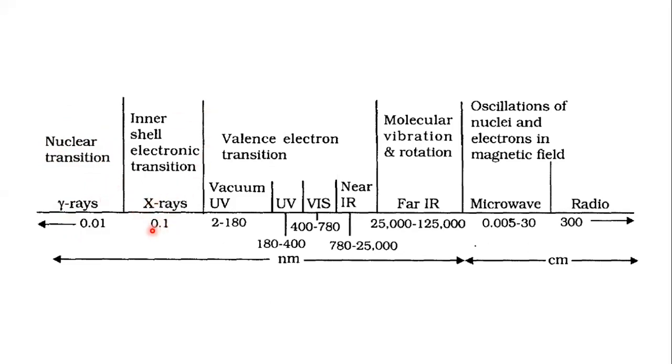The second important range is 0.1 nanometer value.